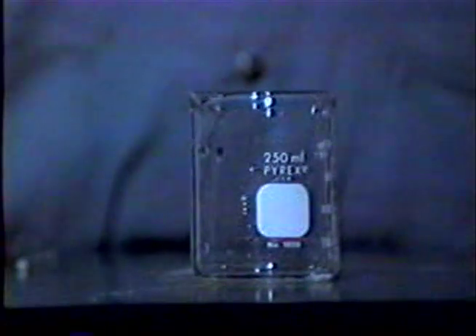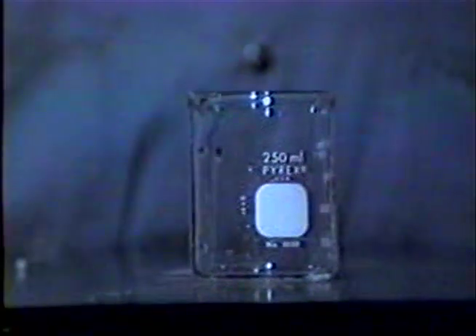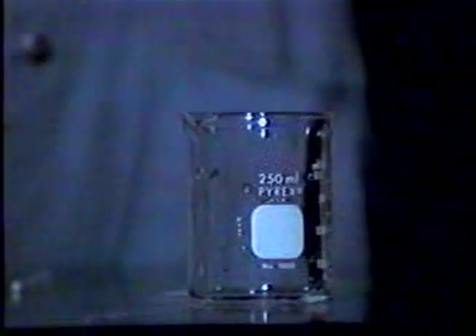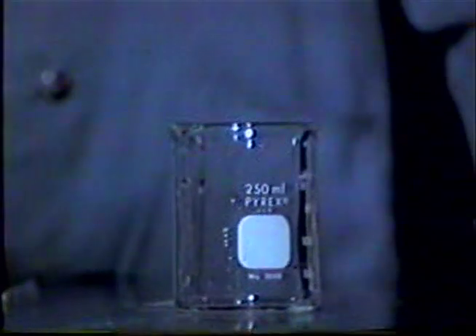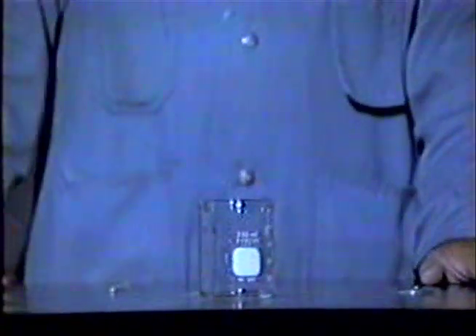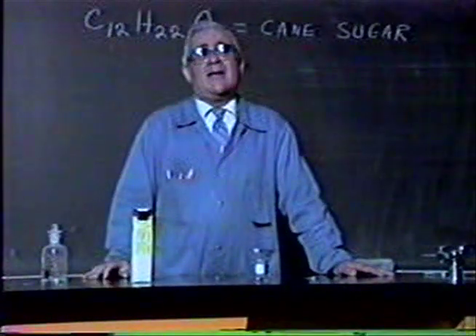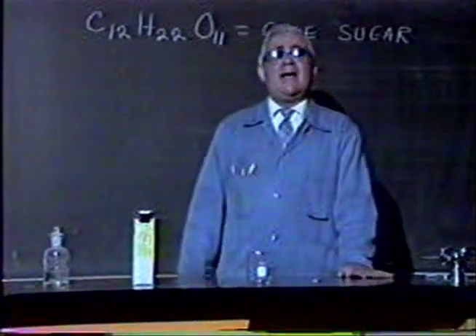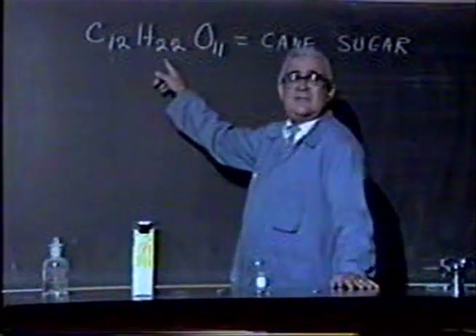In this experiment, we're going to break down sugar into its component parts using sulfuric acid. This experiment is very good to show that a compound such as sugar is made up of elements, and in many cases, the elements that make up the compound do not resemble it in any way, shape, or manner. You probably know that cane sugar is a carbohydrate, like starch and other types of sugars, and the reason we call it a carbohydrate is because it's made up of carbon, hydrogen, and oxygen.